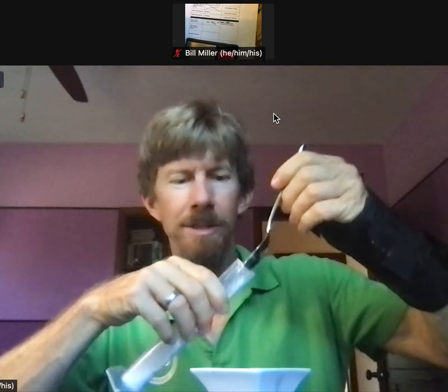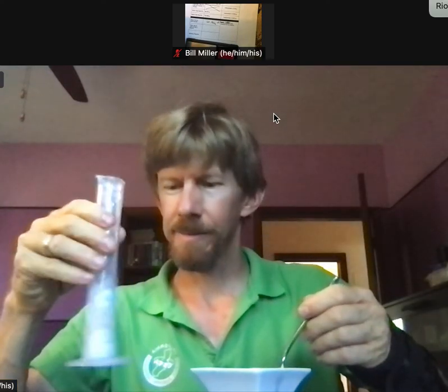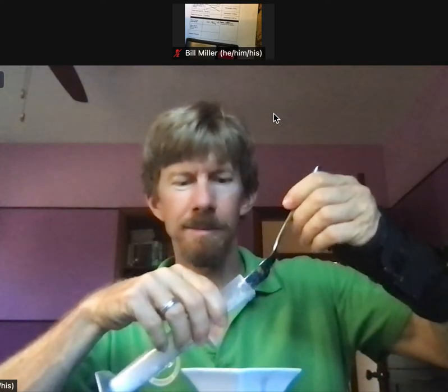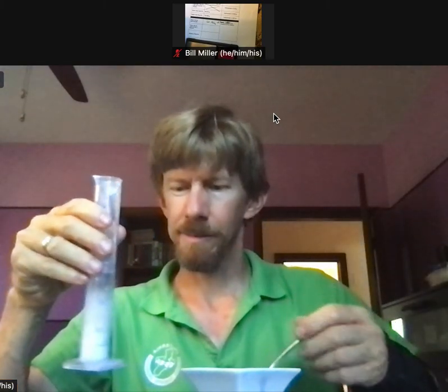I think you have to do about half of what you had because I didn't do the numbers yet. I think I got a big pellet of it down there. Well, we'll see what happens. Oh, we're good. All right. So it says 52.10. That's all I need my scale for. Put that over here. Write that down, 52.10.